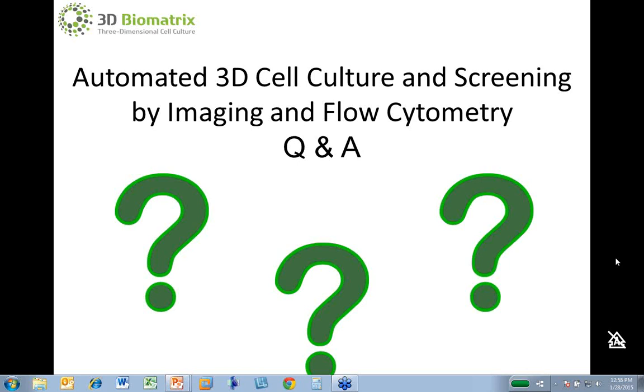And the second thing that will affect drop stability is exceeding the volumes. For the 96 well plate, it's a 50 microliter max volume. If you exceed that, you'll find the drops becoming unstable. And then also, as Mike mentioned, obviously anything that would affect the surface tension of the media can affect it. But for the most part, they're really, really stable. It's no problem to pipette into them and pick them up and move them around, either with your hands or with a robot.